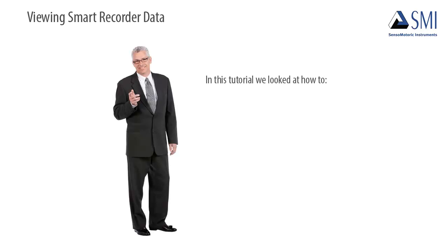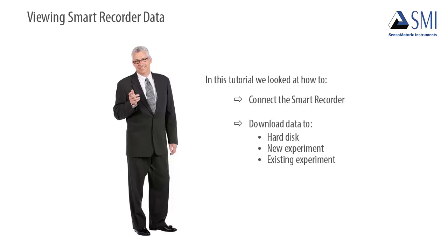In this tutorial, we looked at how to connect the SmartRecorder and the PC, to download data to the hard disk or into a new or existing experiment, and also how to view data within BeGaze.